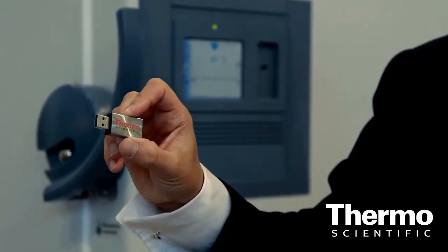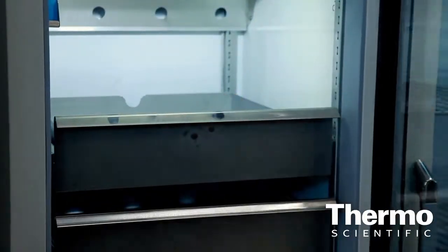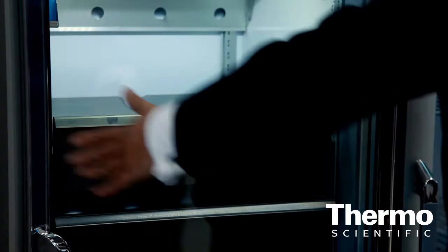The data is taken via a USB port, so you can actually upload it into our scientific service department and we can tell you what went wrong with the instrument. Our complementary cold storage chain goes from controlled rate freezers, systematically taking samples down from ambient temperature to minus 40°C, where the latent heat of the sample is removed.